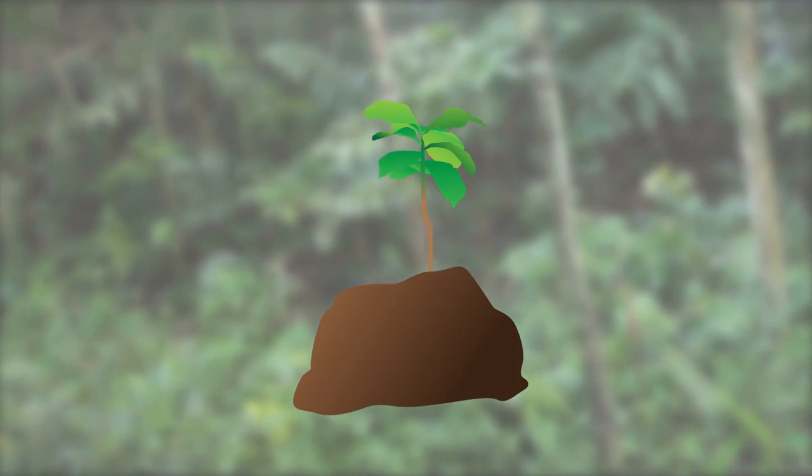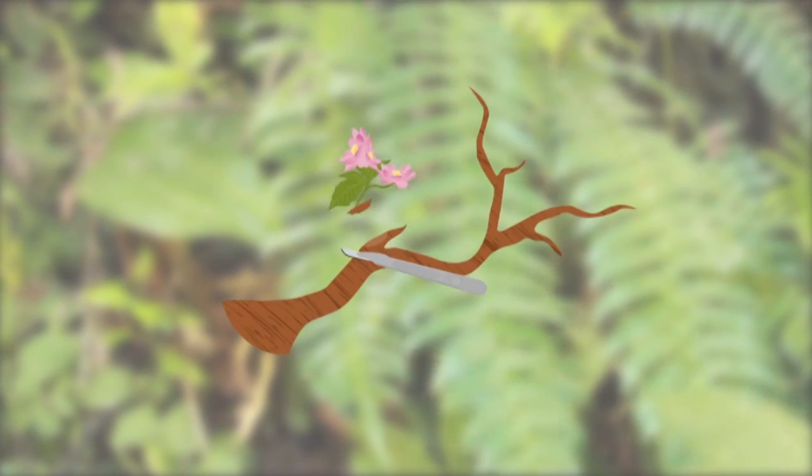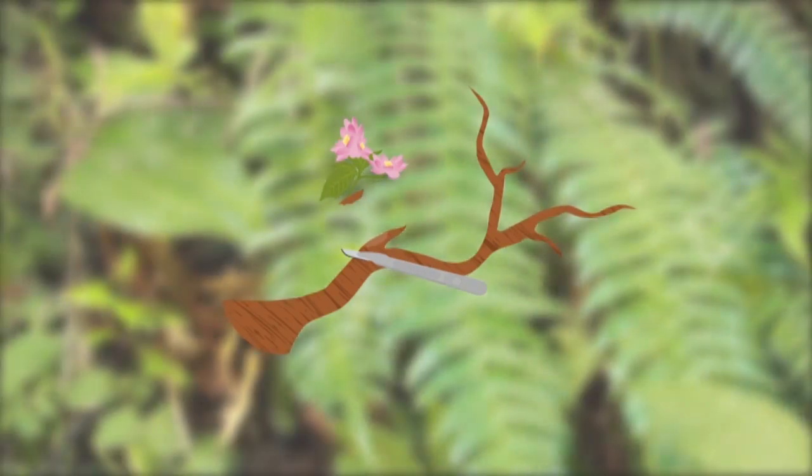For plant samples with roots, clean the soil thoroughly from the roots with clean running water. For fruits and flowers growing on tree trunks, carve them out along with part of the bark.